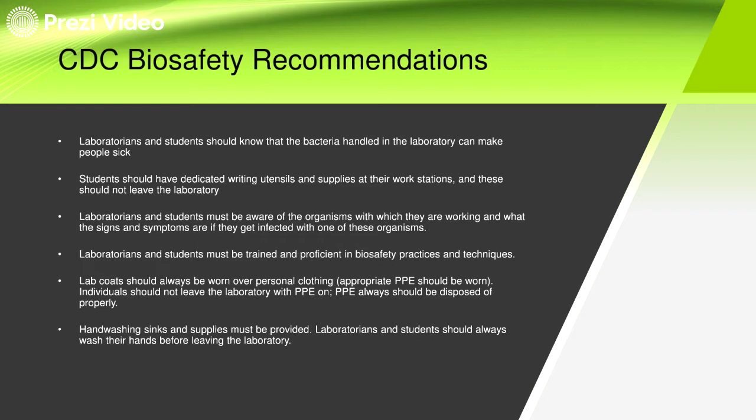Okay? Another thing is that the student should have dedicated writing utensils and supplies in the workstation. So, the ballpens in the lab, you don't bring those home. You just leave them. Why? Because they're actually a source of fomites. Fomites are inanimate objects, lifeless objects, that can actually get the microorganism. These are what bacteria attach to. Like a ballpen, it's lifeless, but bacteria can attach to it. So, if you bring it home, it's possible that you bring the bacteria home.